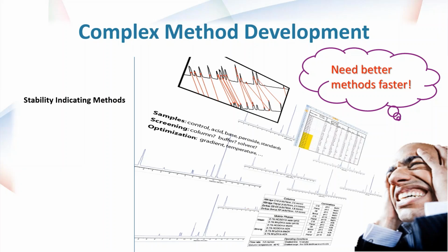Stability indicating methods are very important as they're typically used hundreds to thousands of times to identify materials that are out of specification or out of trend for quality control to ensure efficacy, safety, and quality. Moreover, if a coeluting component is discovered in a stability indicating method after it's been established, that method needs to be redeveloped and revalidated.